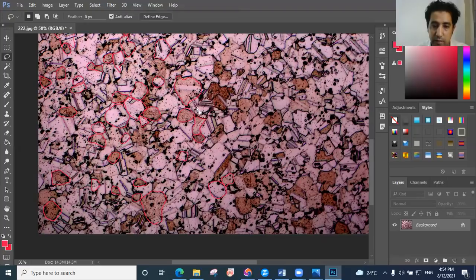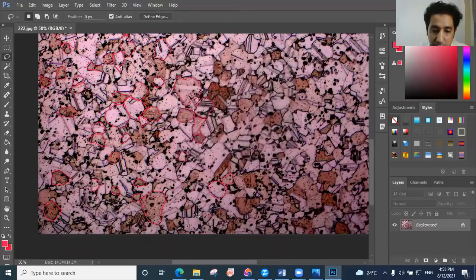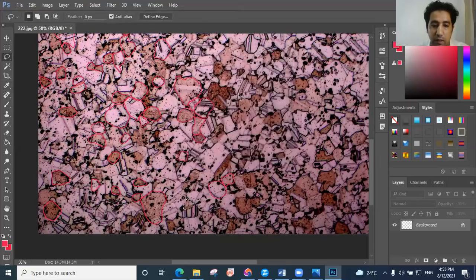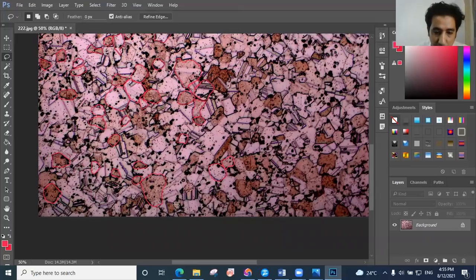If you see this grain is covered, you can just do it because all the grains will be calculated together. So you need to just cover this again too. And also here, there is another grain. And just keep moving.